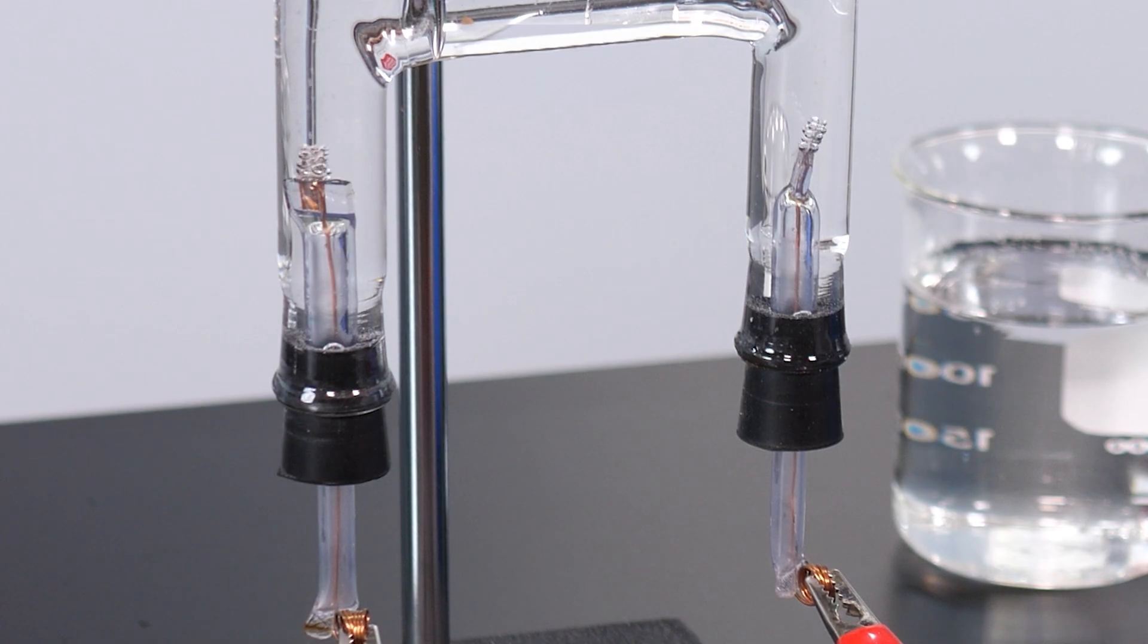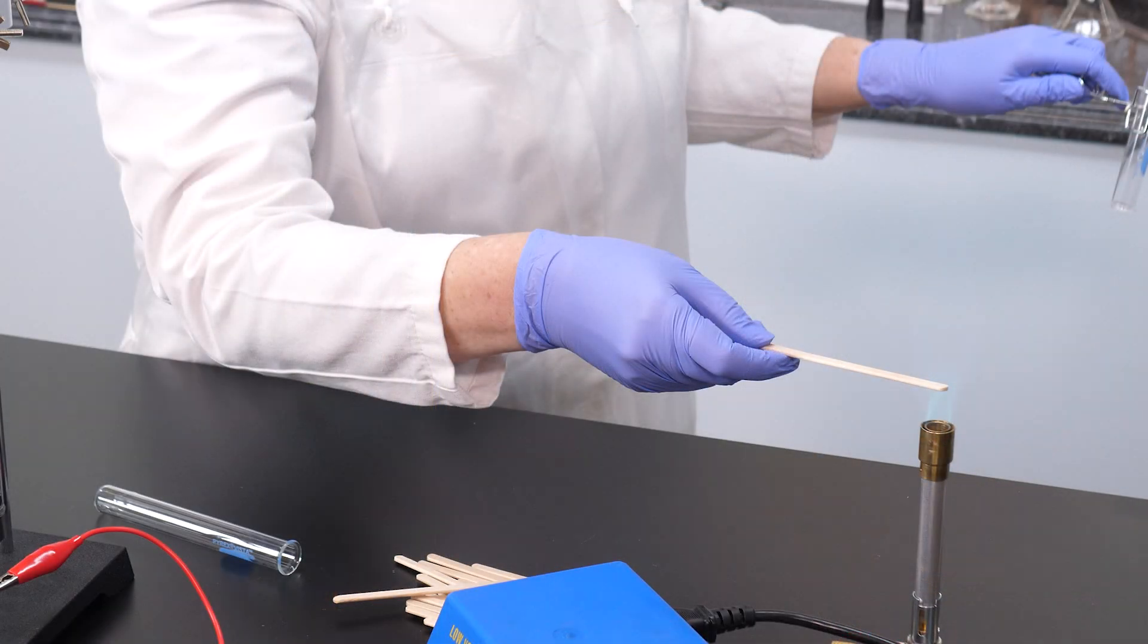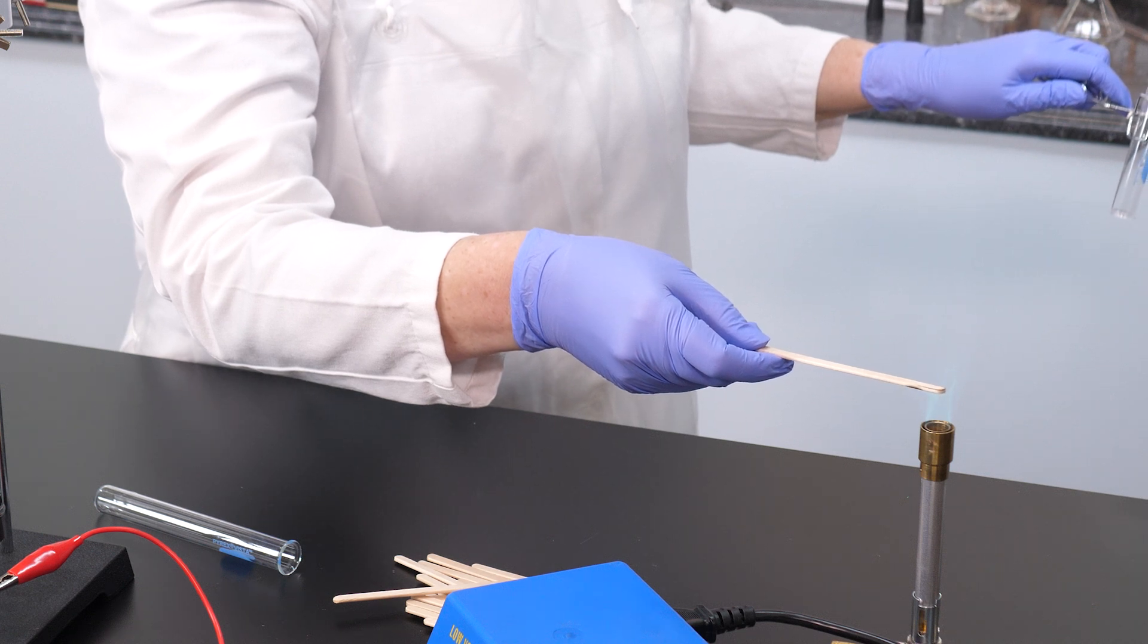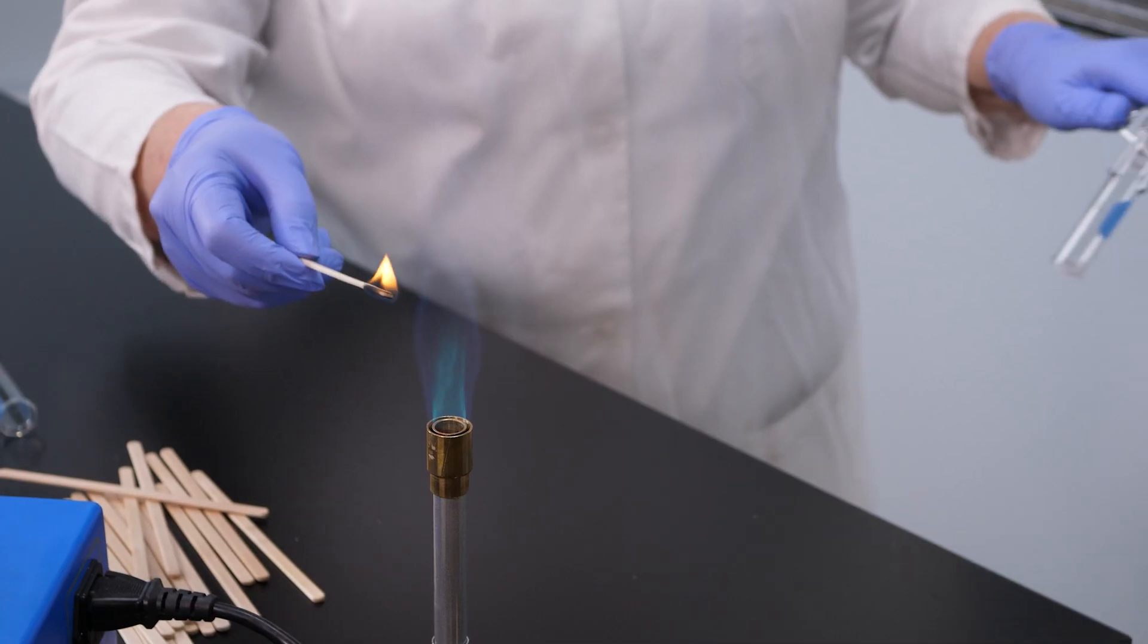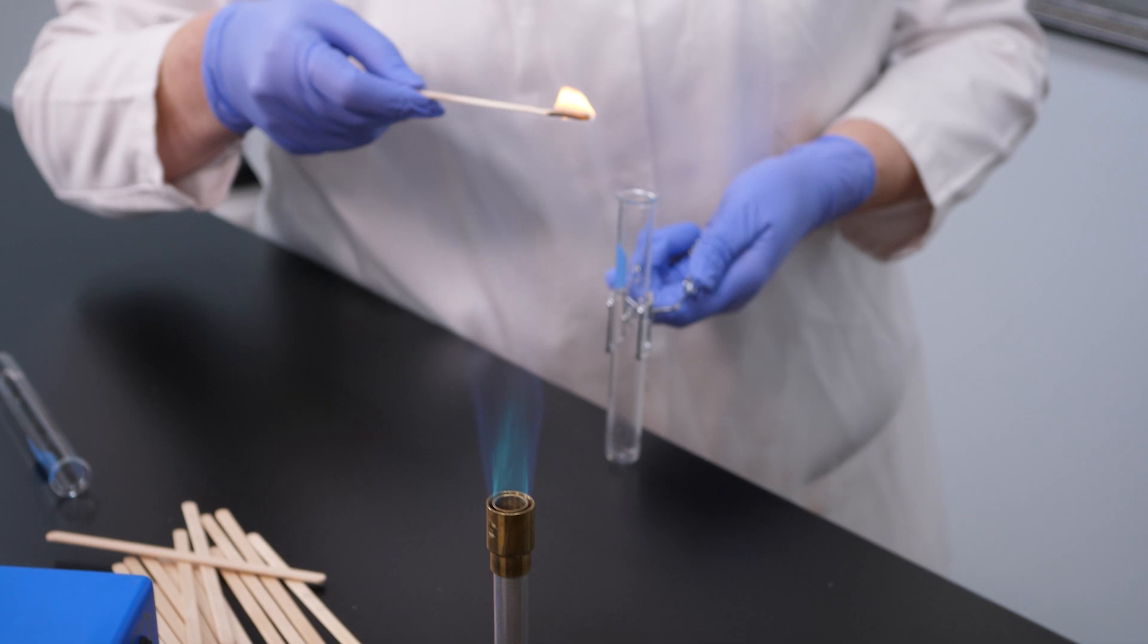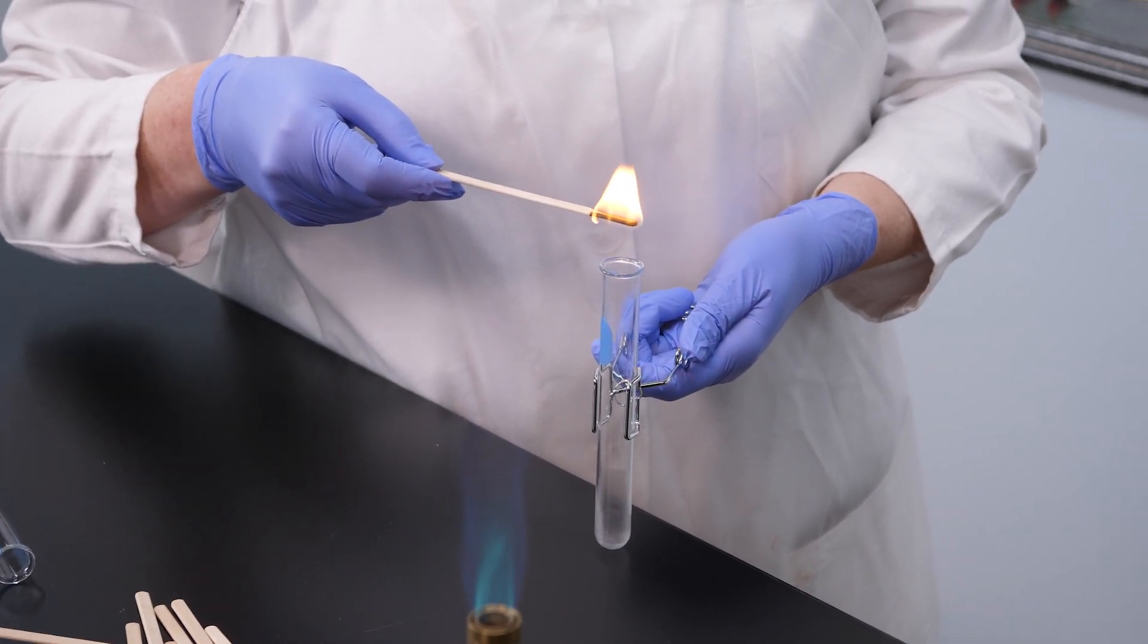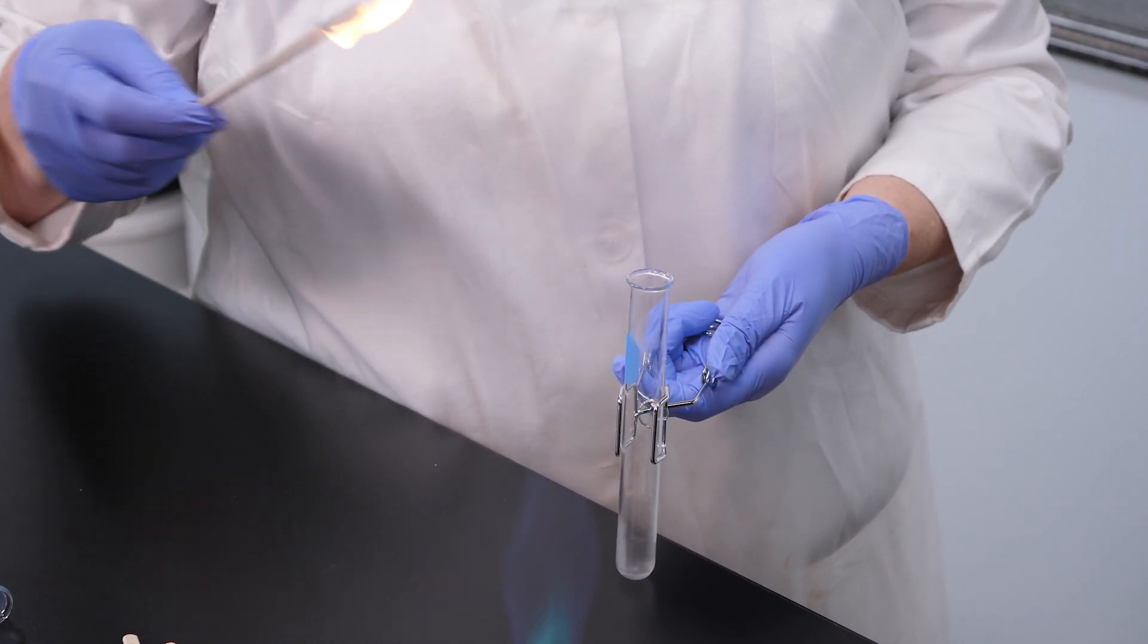Bubbles of hydrogen gas formed at the electrode in the left tube. Bubbles of oxygen gas formed at the electrode in the right tube. We used a wood splint to prove we collected hydrogen gas. When the flame from the wood splint came near the tube, the hydrogen gas ignited and produced a loud pop, proving we had hydrogen gas in the tube.